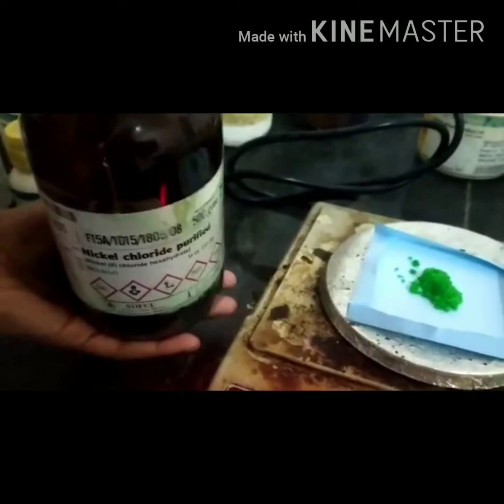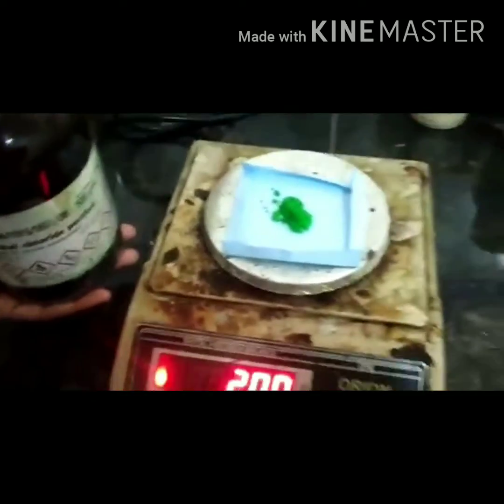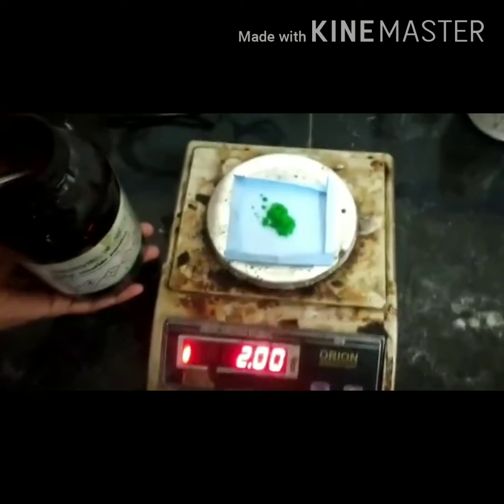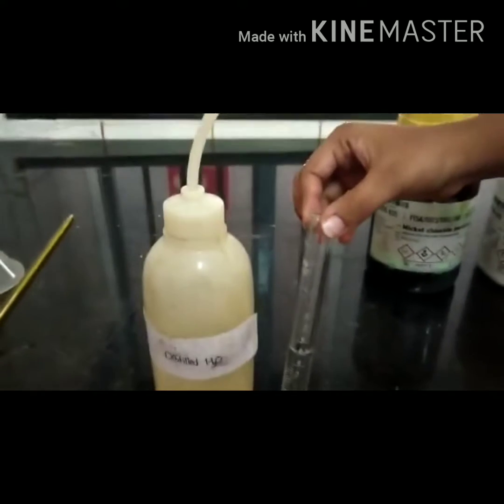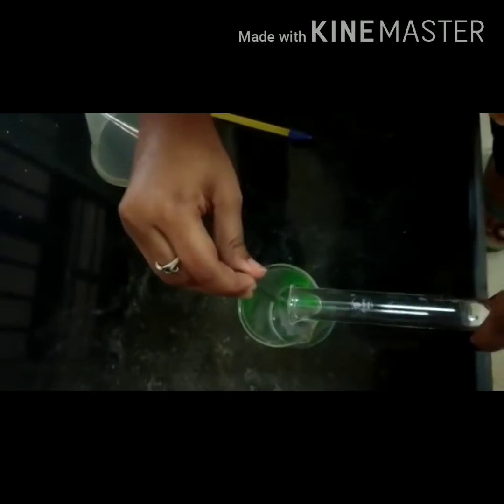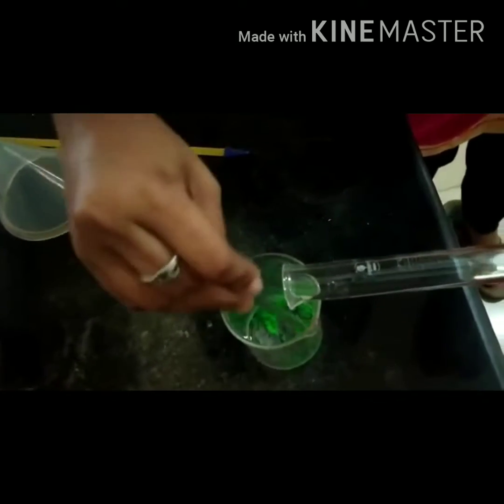Procedure: Weigh 2 grams of nickel chloride crystals and transfer them into a beaker. Then measure 5 ml of distilled water and add the water into the nickel chloride crystals with stirring. This gives the nickel chloride solution.